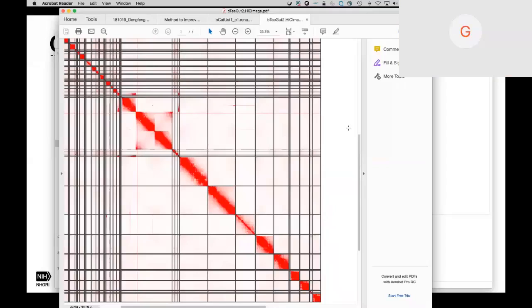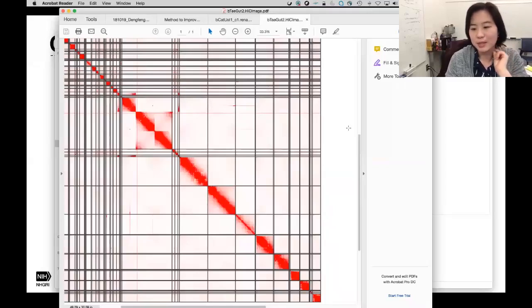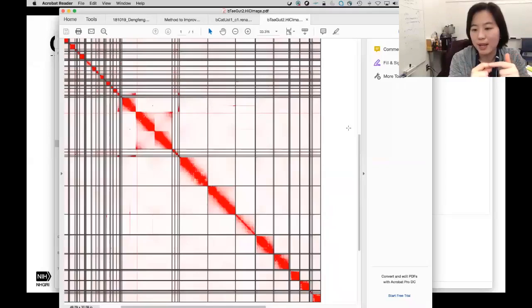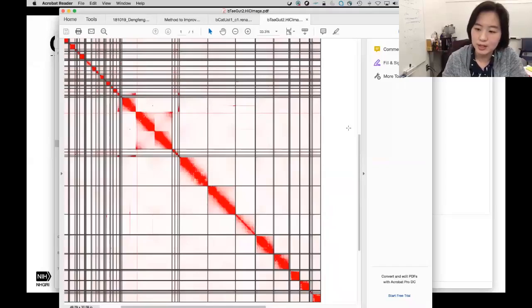But I only remember that you can't really get the best orientation out of the reads because you lose the orientation information while doing the linking. So sometimes you're not sure whether you're linking this way or the other way, or just pulling out whatever got picked, right? So the template itself may not be 100% the same orientation. Does that make sense? Yeah, so it's hard to make an assumption that the read pair locations are representing the exact same orientation. That's why Hi-C is prone to inversion error types.